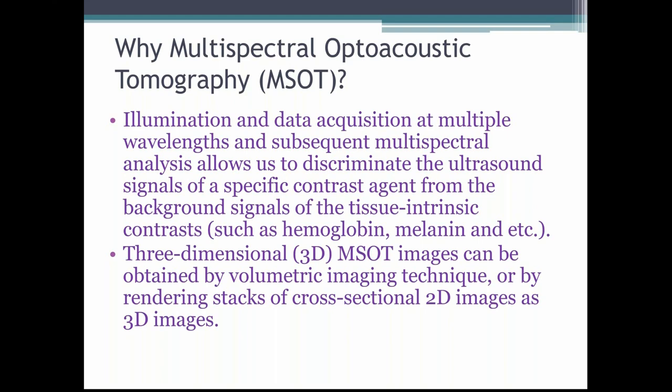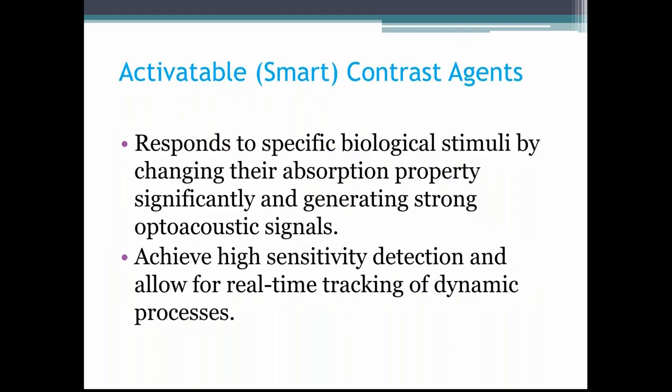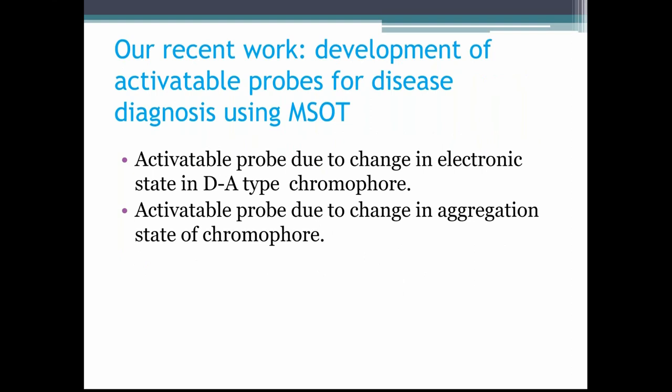And in optoacoustic imaging, activatable contrast agents have advantageous features since they can respond to specific biological stimuli by changing their absorption property significantly and generating strong optoacoustic signals. And high sensitivity detection can be achieved, and also real-time tracking of dynamic processes can be realized. And therefore, by using MSOT imaging, we can accurately locate and determine the position of the disease and the volume of the disease foci.